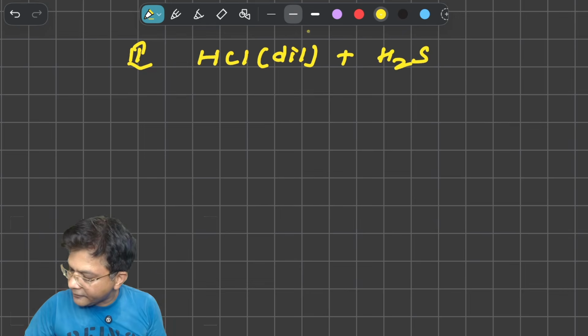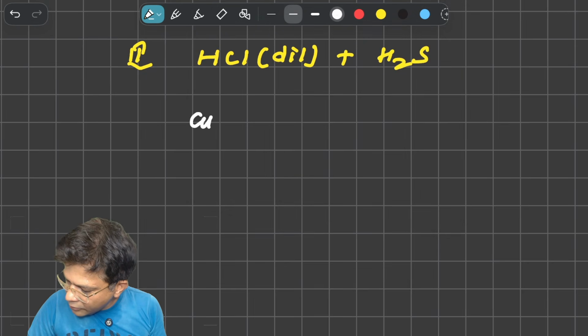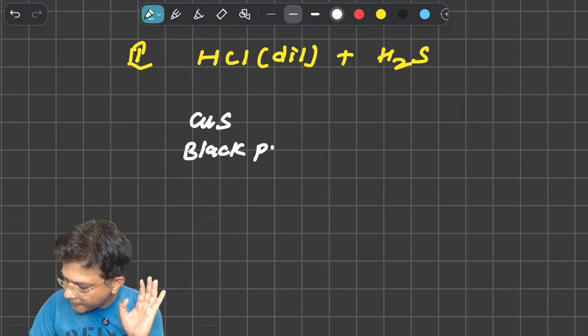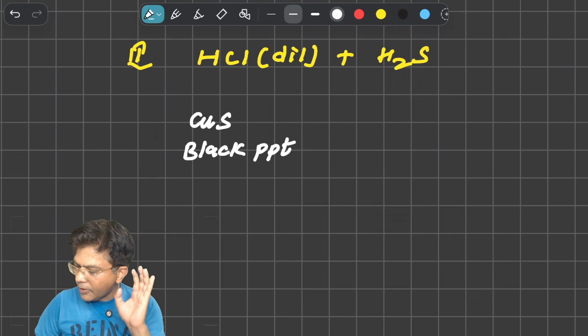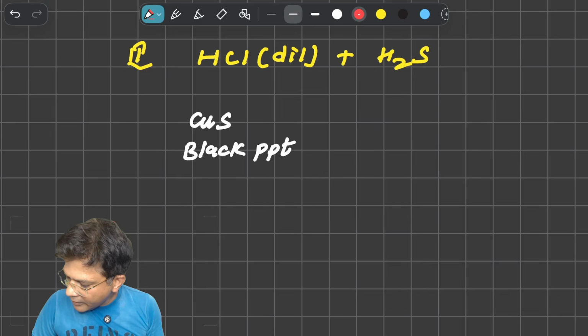For example, Cu: CuS is in the second group and it is a black PPT. Remember that it is a black PPT.